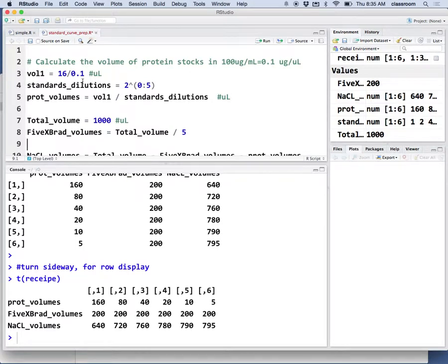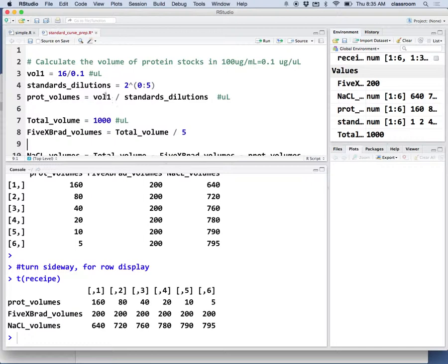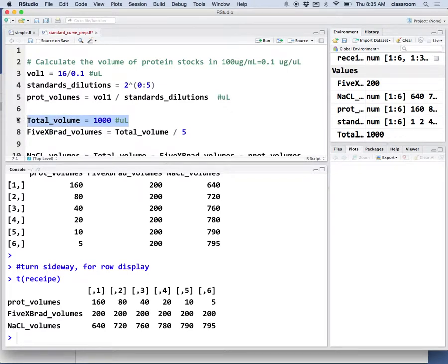This is a small example using R code to show how we can prepare the recipe for protein standard curve. The total volume is 1000 microliters, that's the total volume we need.